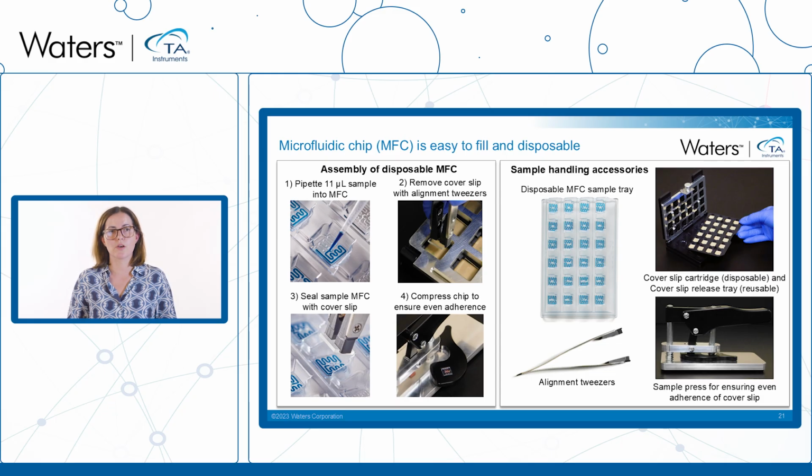in the previous video. Again, all the microfluidic chip preparation tools are designed for you to easily prepare samples. All the tools you see here have alignment features to help you place the cover slips correctly on the top of the chip. Because these are disposable chips, after you run your samples, the microfluidic chips are thrown away, therefore completely eliminating the need for any cleaning of the instrument.